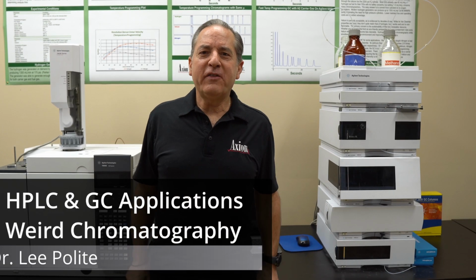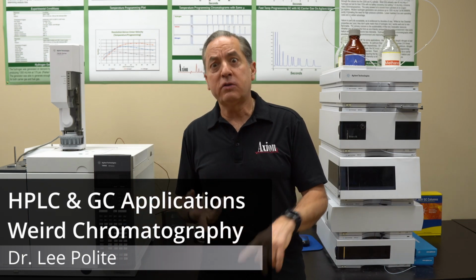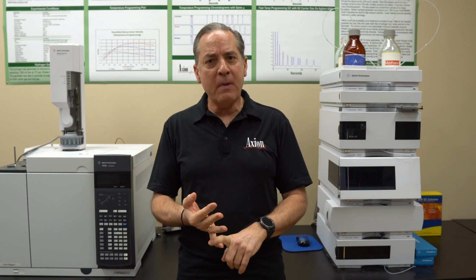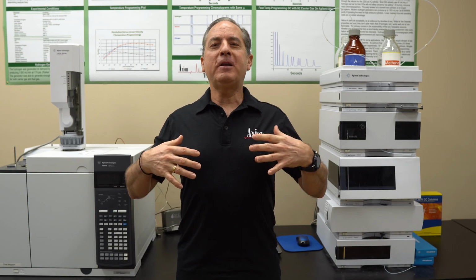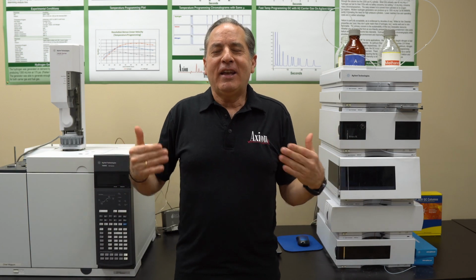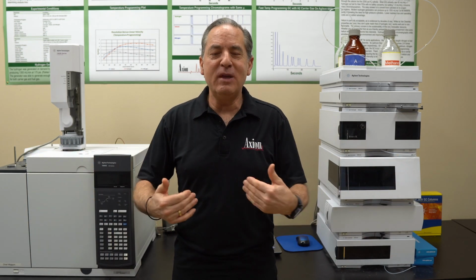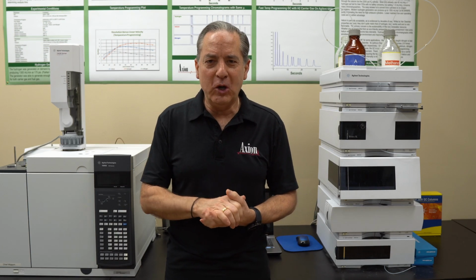So I've taken you through all the different application categories. I've taken you through the petroleum industry, the chemical industry, the pharmaceutical, which is huge, the environmental, the food, flavor, and fragrance. But I've taught this for 30 years, and after these 30 years, I get to meet some interesting people in what I call some miscellaneous industries, things that even catch me by surprise. And I'll share a couple of them with you.